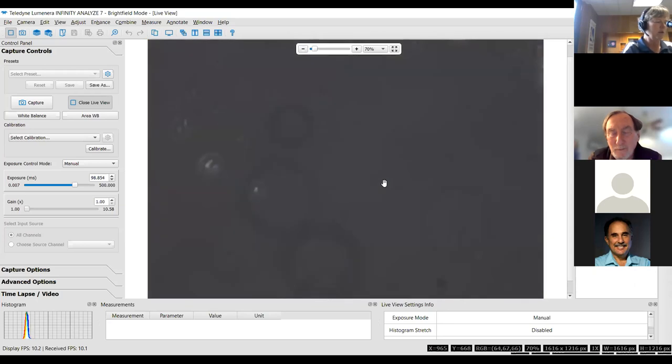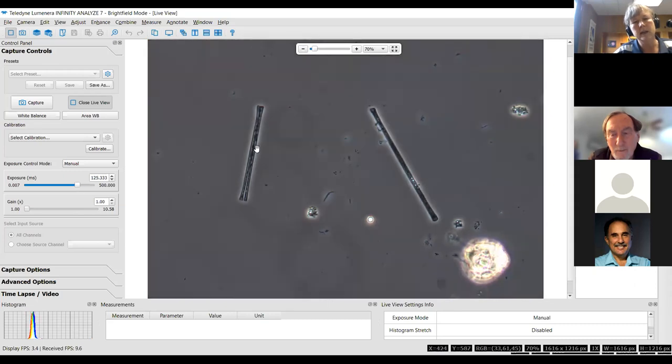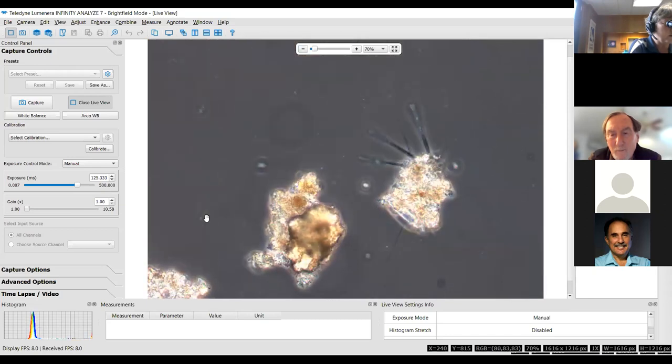And then let's look at a quick diatom sample. This is actually from Michigan. Just a quick note, Diatoma and Asterionella can look somewhat similar. And so you are actually looking for these striae that are easily visible on the ends of the cells, which you just have to focus up and down and look for those. They're hard to show on the scope when I'm sharing it. But just be aware that those two things will often co-occur.